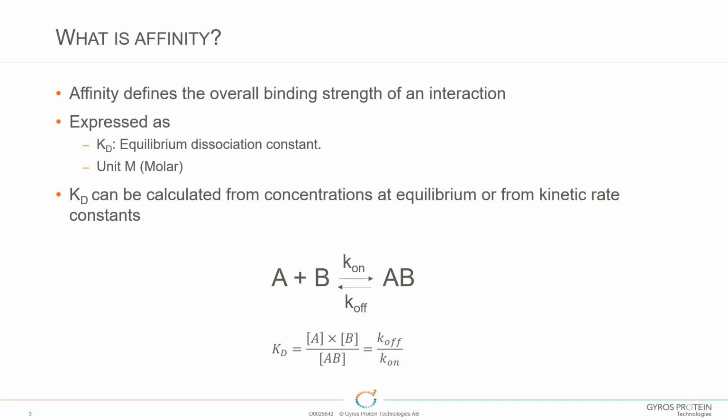Yeah, I think that's the main thing when setting up the experiments. You need to move away from mass units into molarity, and I know from my own personal experience and working with people that can cause some difficulty. So I think we will focus on a future podcast much more on how to set the experiments up with practical examples. But today really is an overview of the theoretical basis of affinity and how we can use the Gyrolab to do affinity calculations.